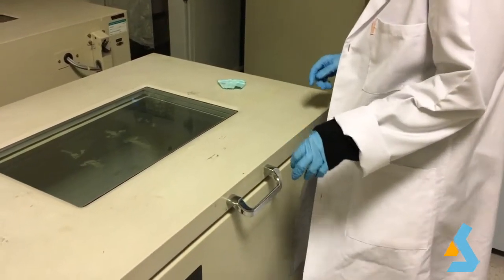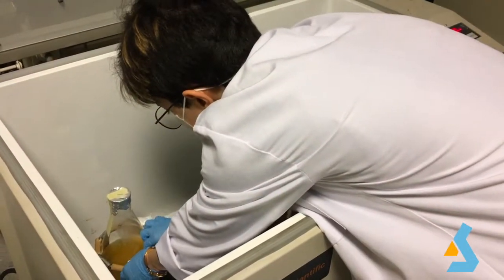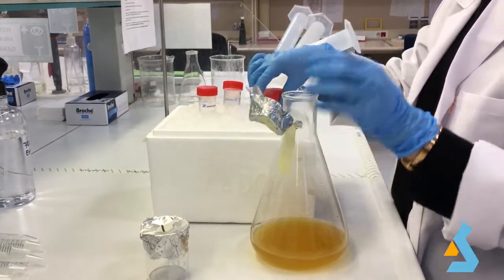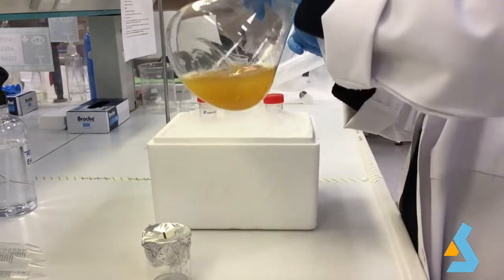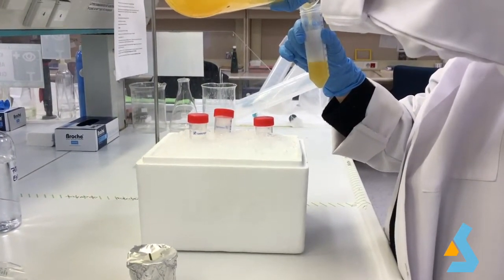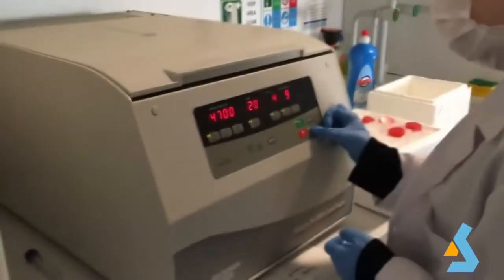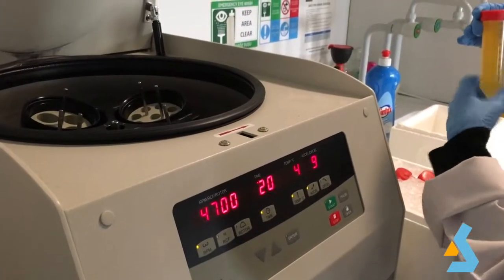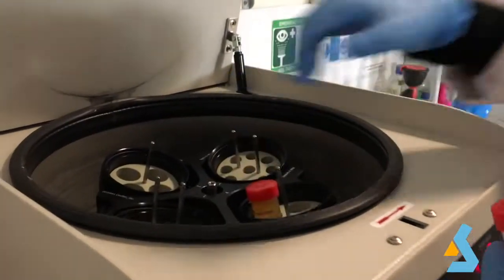After the induction of protein expression, we take the culture from the incubator. Then we divide the culture into 4 pre-chilled Falcon tubes. To remove media from bacterial culture, we centrifuge the tubes at 4700 RPM for 20 minutes at 4 degrees Celsius. Make sure that each tube has identical amounts for a balanced centrifuge.